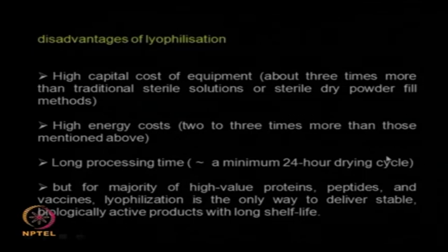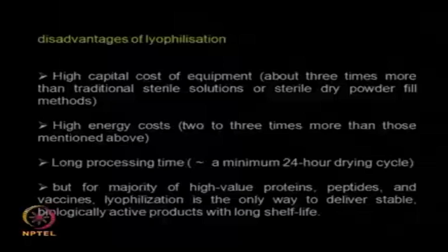If I am going for conventional drying where I am applying vacuum and heating the material so that the water becomes vapor, I may finish it in a few hours, whereas in lyophilization or freeze drying, where I am freezing the material and then changing the temperature and pressure to remove the moisture, it may take 24 to 48 hours.